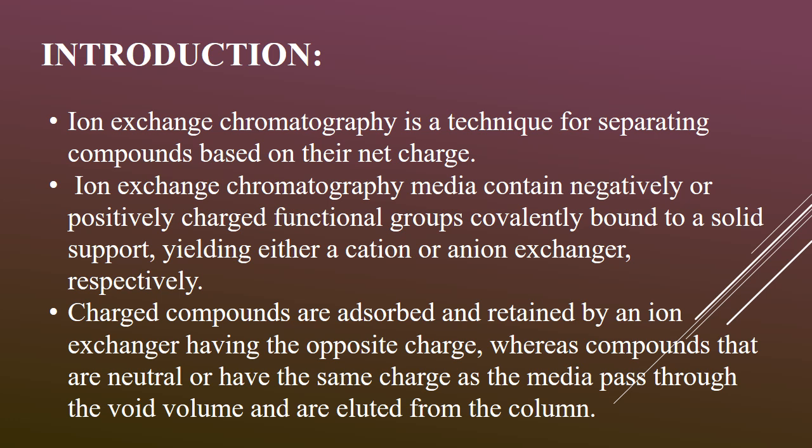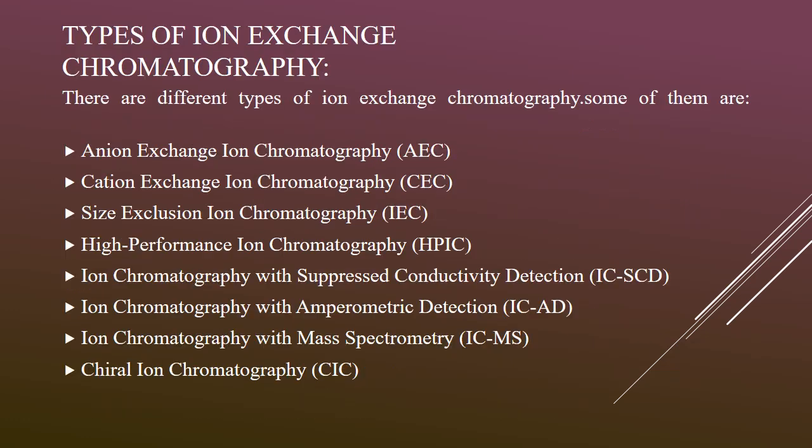The binding of the charged compound is reversible and adsorbed compounds are commonly eluted with a salt or pH gradient. Ion exchange media are available in various particle sizes, ionic forms, and purity ranges. Ion exchange chromatography is most often performed in the form of column chromatography.